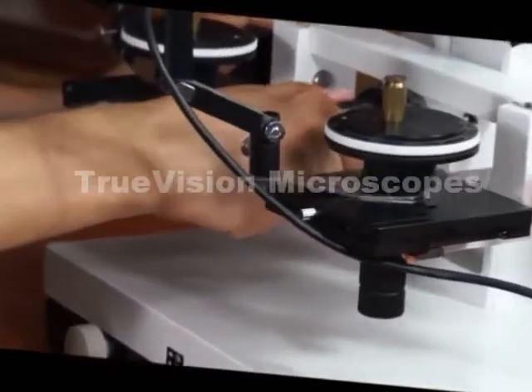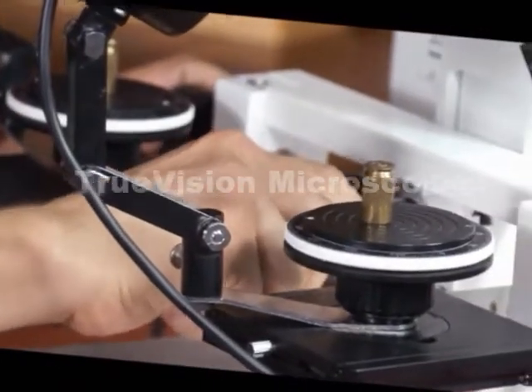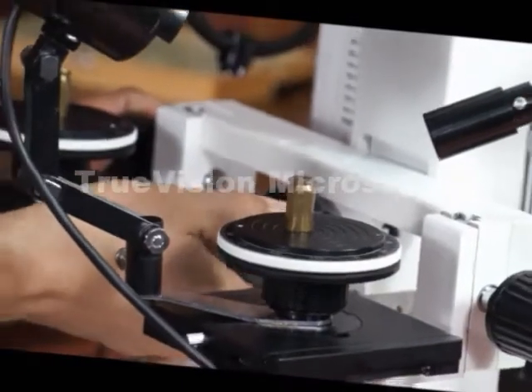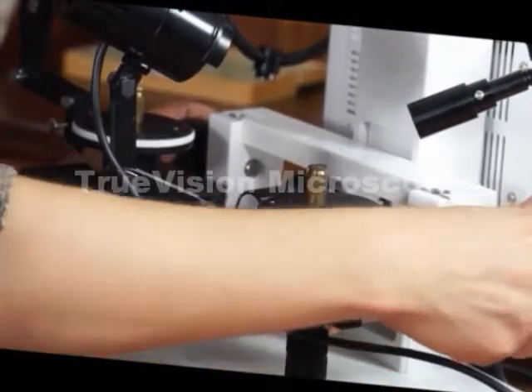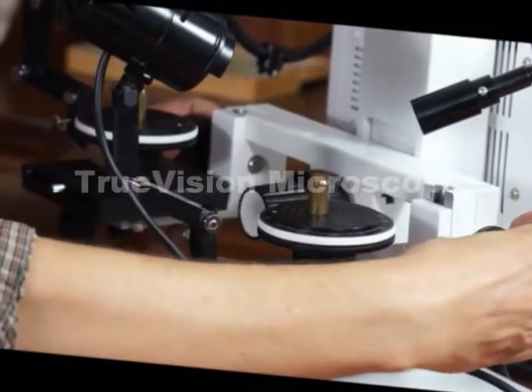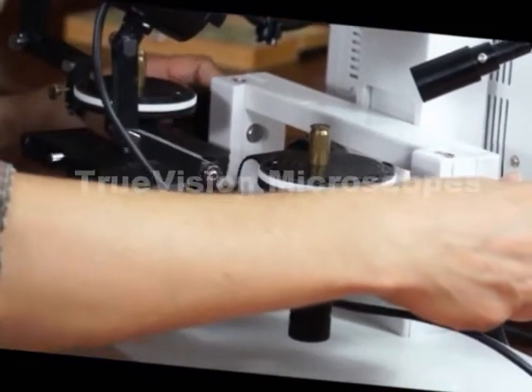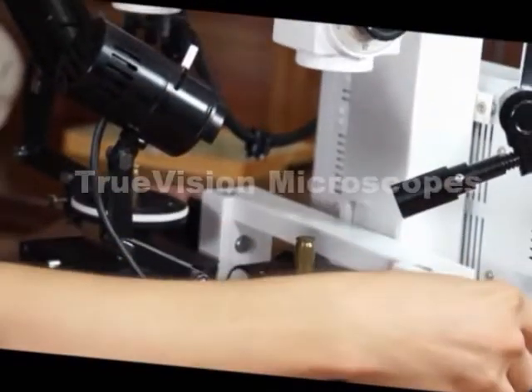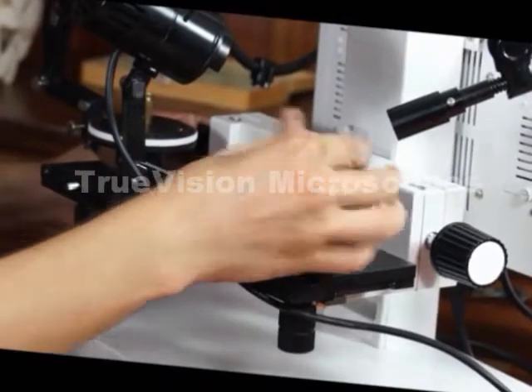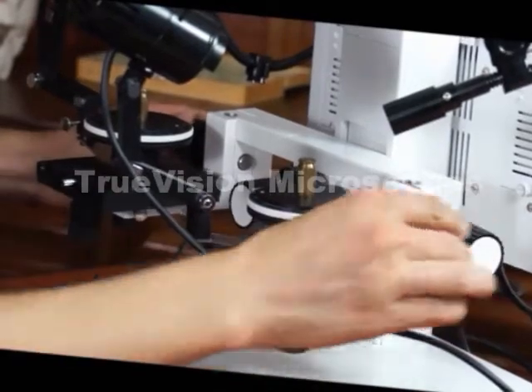This knob focuses both stages at the same time — both stages move up and down together. These knobs focus independently. So looking into the eyepieces, you have to ensure that each specimen is in focus, and you adjust both of these independent knobs to do that.